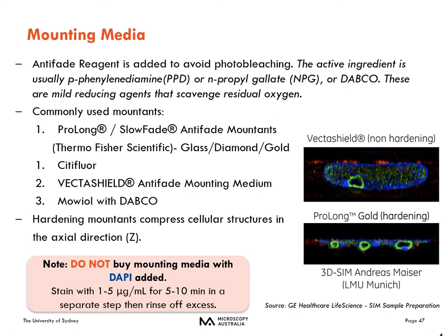You have to be quite careful if your sample is using a hardening mounting medium. The axial direction might get compressed during hardening. Also, a very important note: please do not buy mounting media with DAPI inside, because it will cause an excessive amount of background. You have a lot of background noise, and you can't get rid of the excess DAPI because it's already in the mounting media.